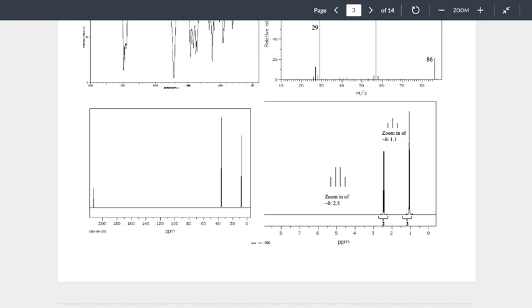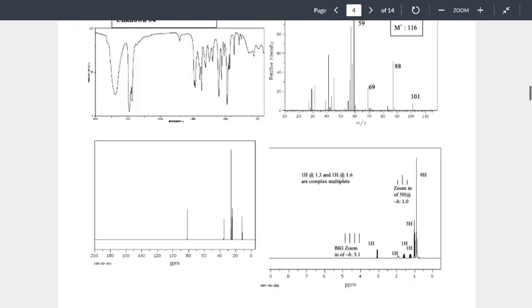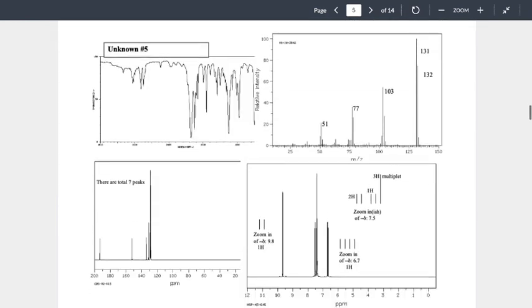I'm very curious. So, integration information underneath 2, 3. That is how it is typically given. So if we go through and look at these, you'll see a bunch of the numbers next to it.